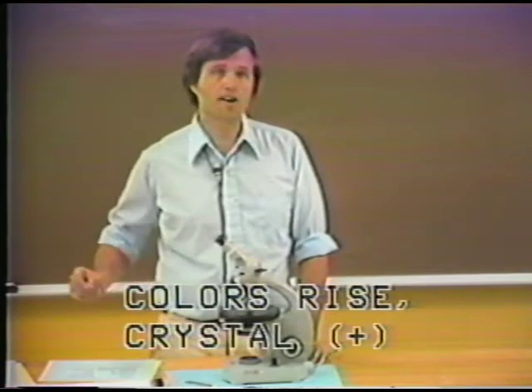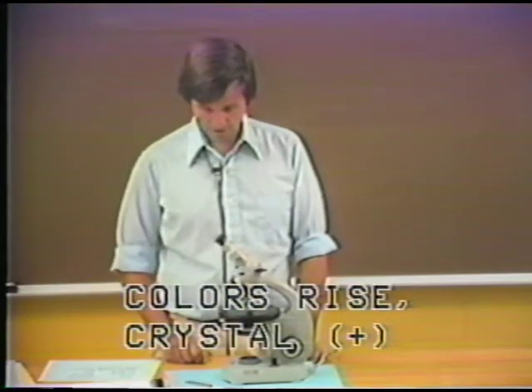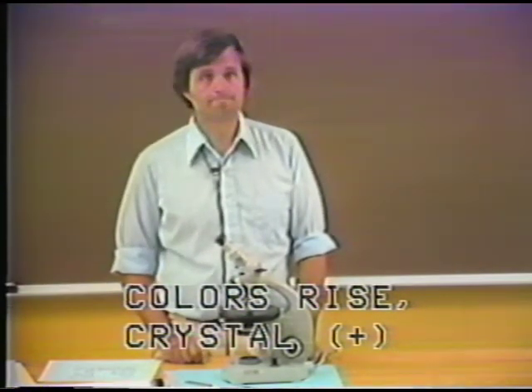Now, the opposite of this kind of test would show the color curves contracting in this northeast direction. And if the color curves contract, we say that the colors rise for the crystal, and that the optic sign of the mineral then would be positive. If the colors rise, the optic sign is positive.